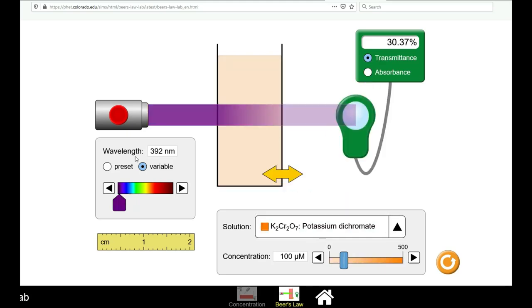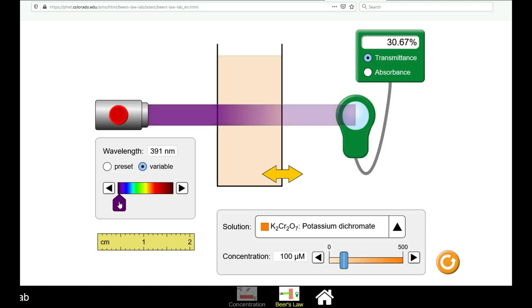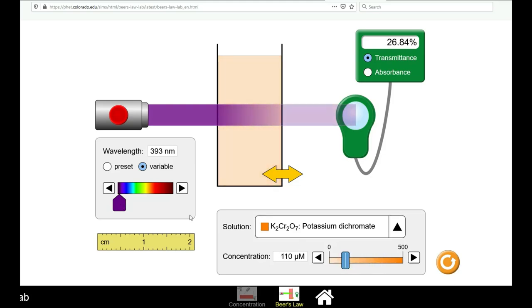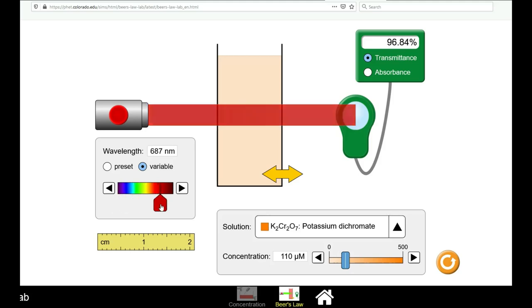You will then vary through the entire visible region spectrum at 20 nanometer intervals and record the percent transmittance. Please make sure that whichever concentration you choose, the percent transmittance value is above 10 percent for every wavelength.